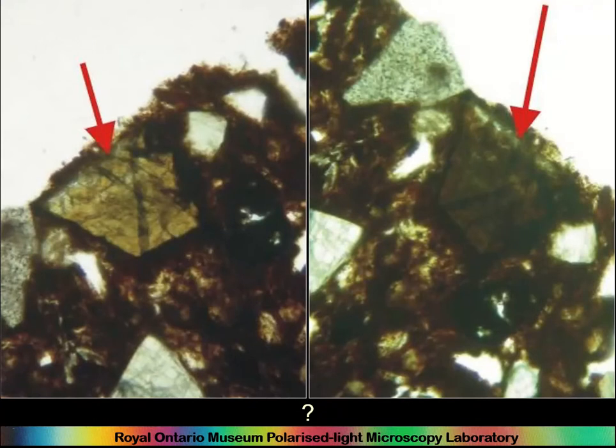So, knowing properties of inclusions in thin section is very important. In fact, it's pretty much the entire point of this course, because it enables you to identify inclusions, but even more importantly, it enables you to describe them.